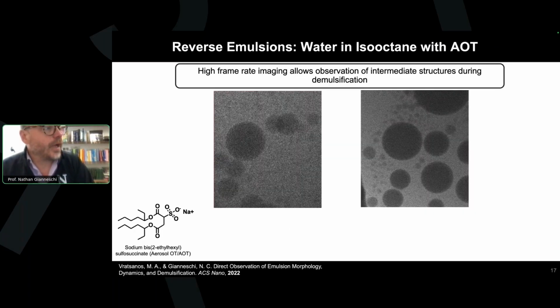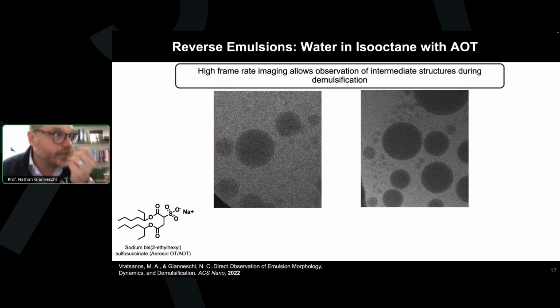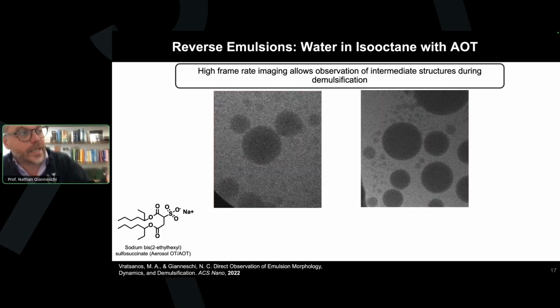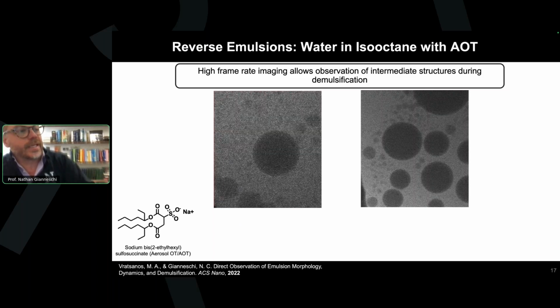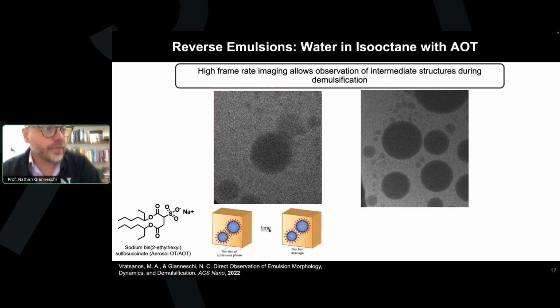This is an example of looking at coalescence of those other types, I should say, of emulsions. Dynamically, these would obviously be impossible by other methods. We can study energetics of these processes. We can study surfactant chemistry, or let's say the propensity of a given surfactant to break up these emulsions or to stabilize them, and we can look at different mechanisms.